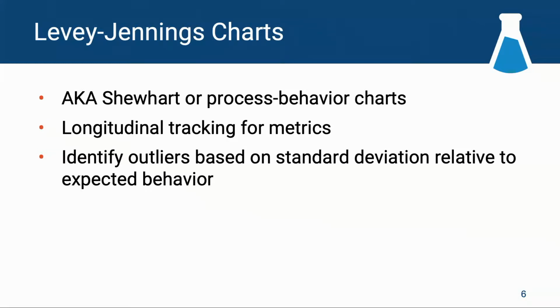And think of this as really the longitudinal tracking, right? You run a bunch of history on this so you know what your expected values are, you know what your normal variation is, because odds are, even if something's supposed to be pegged at, say, 1,000, whatever the output is that you're measuring, it's probably got a little noise to it, moving up and down. But there are a lot of different ways that you can identify these things, either having already gone out of range or maybe predictors that this is going to become a real problem in your process.